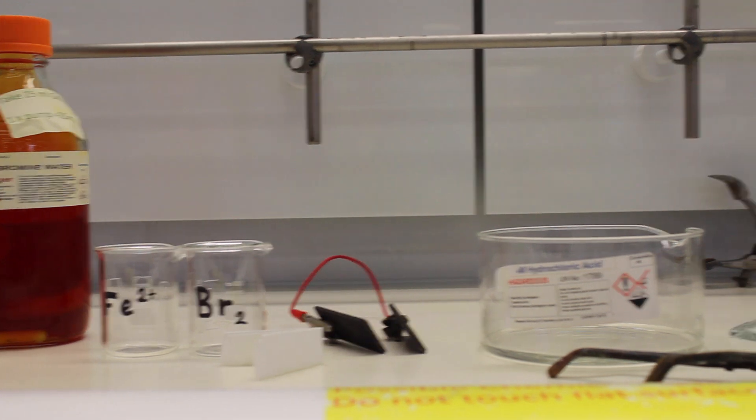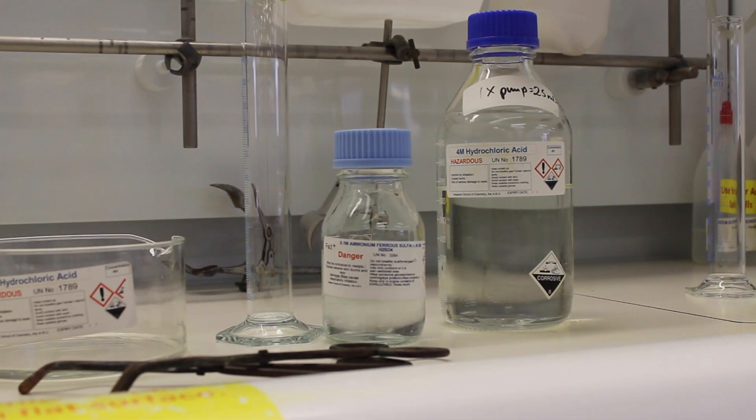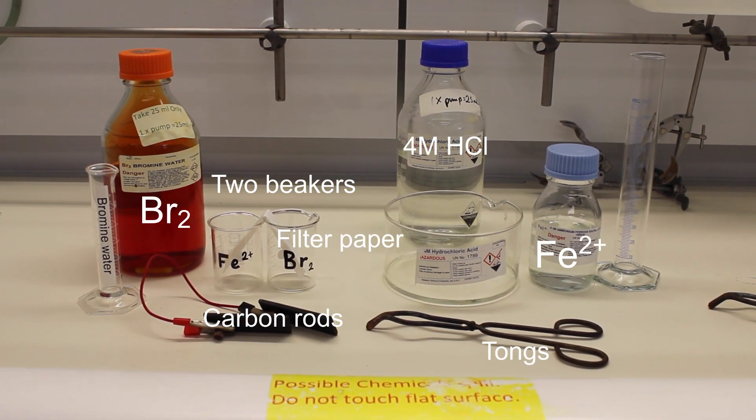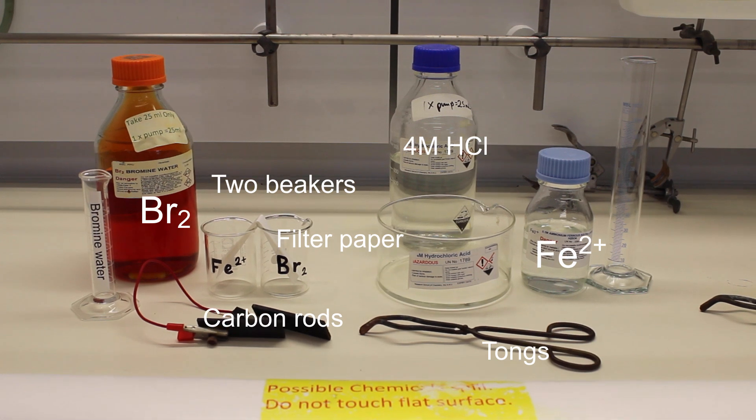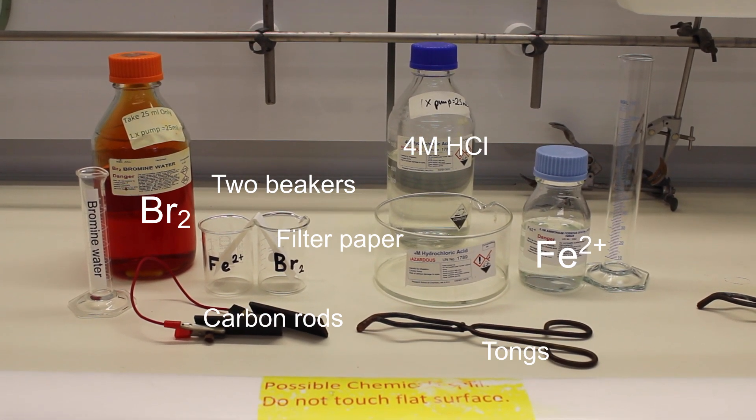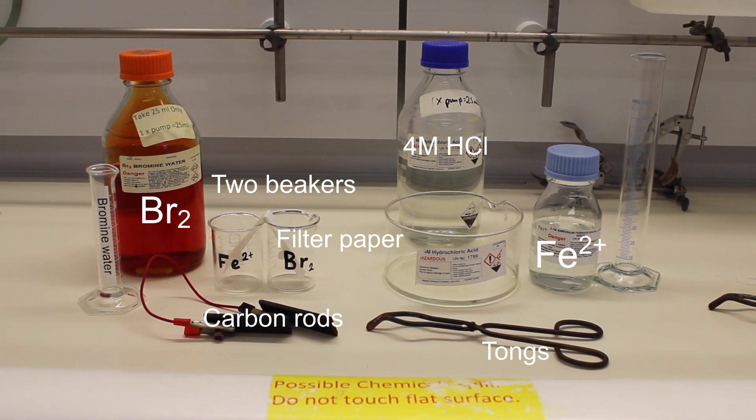Now we'll use our bromine and iron couples to set up an electrochemical cell in the fume hood. You will need bromine water, two 100 ml beakers, a solution of iron 2+, two carbon rods joined by a copper wire, four molar hydrochloric acid, a large piece of filter paper, tongs and gloves.